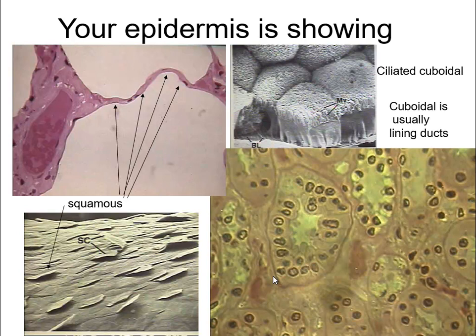Squamous are easy because they're flat — there's no mistaking them. If you look, the nucleus looks almost like a fried egg: you have a flat egg with a little bit of yolk sticking up. That would be your squamous cell.